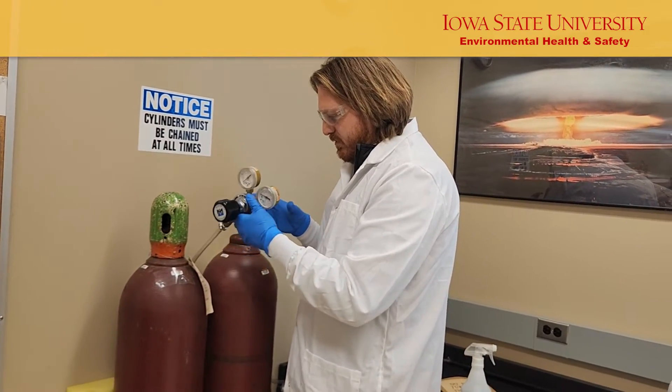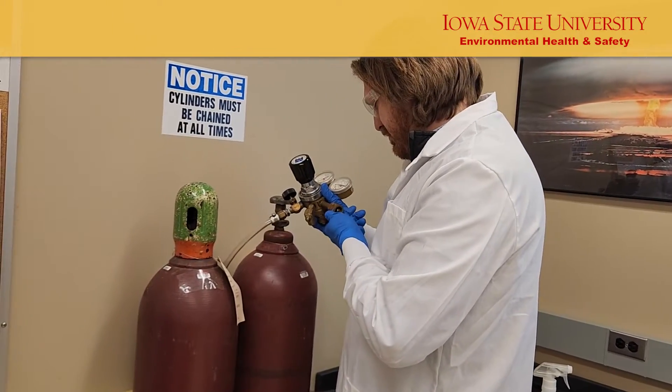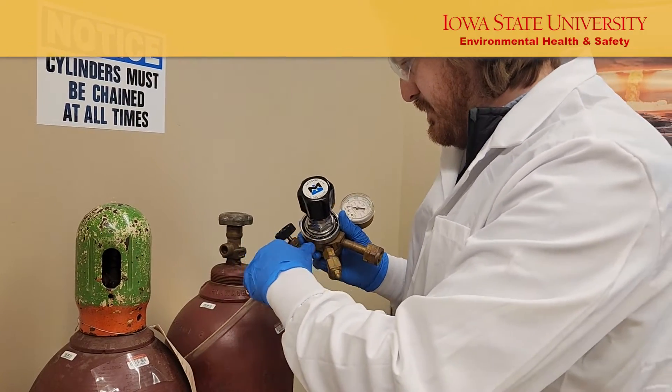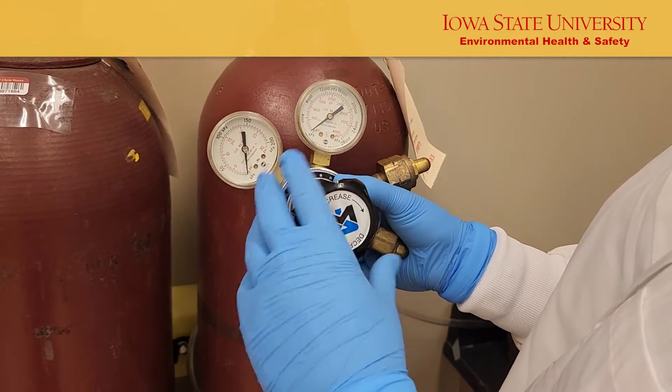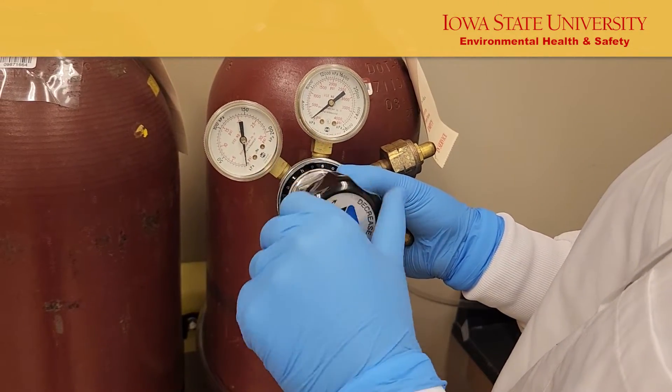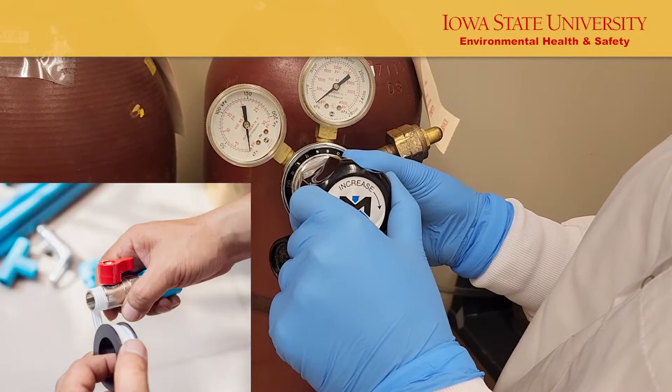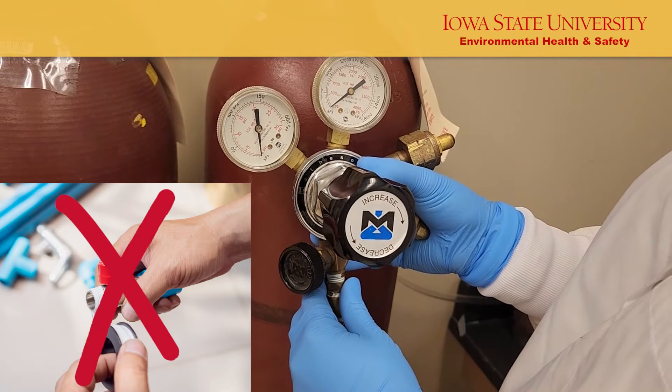Perform a visual inspection before each use to detect any damage, cracks, corrosion, or other defects. Ensure the regulator pressure control valve is closed before attaching it to the cylinder. Never use Teflon tape on cylinders or tube fitting connections.